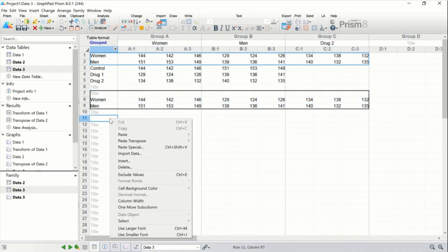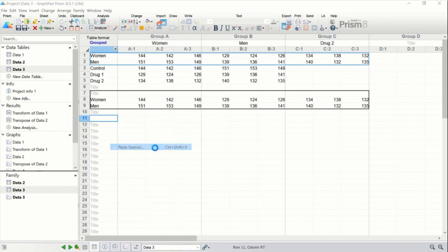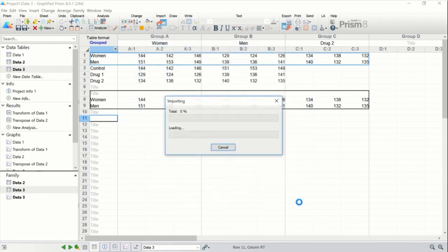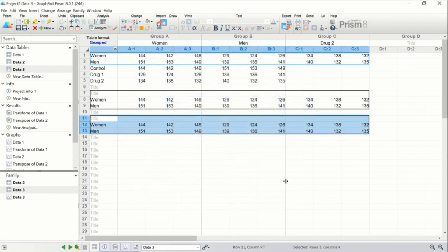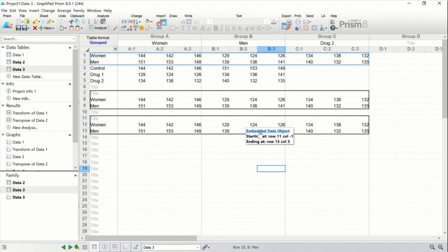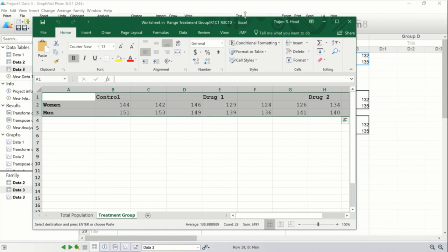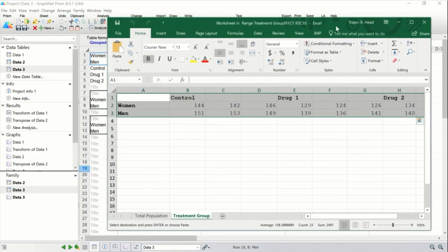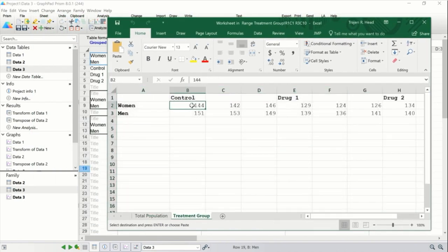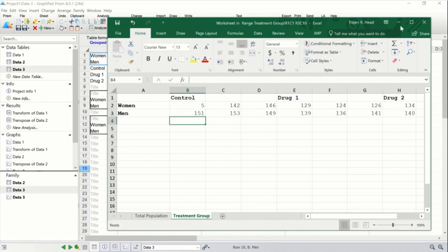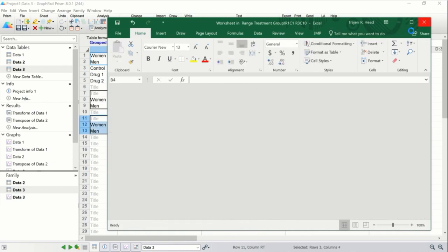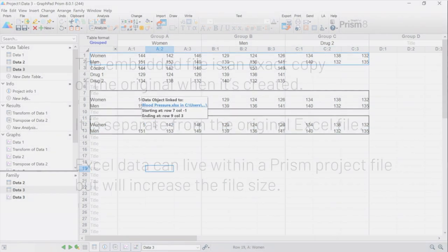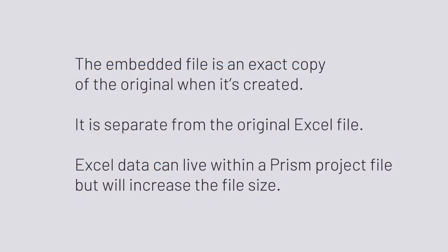Alternatively, we could have chosen to paste embed the data. Since the data is still copied, we could again go to the import and paste special dialog and choose embed. This time, when we click paste, the data are entered and linked, but the source of the data is a brand new copy of the Excel workbook that's stored within the Prism file. If I hover over the linked data to access the source, I can click on embedded data object to open the new Excel workbook with all of the sheets and data of the original. If I change a value in this workbook, the data linked from the embedded file will be updated, but the data linked from the external file won't be. The embedded file is an exact copy of the original when it's created, but is separate from the original Excel file. This means that your Excel data can live within your Prism project file, but has the drawback of increasing the file size of your Prism files.